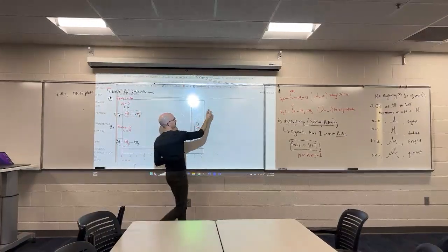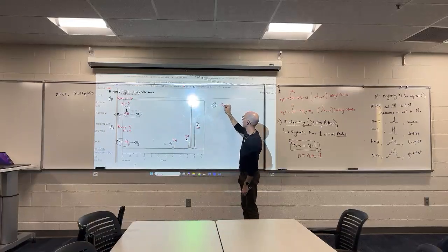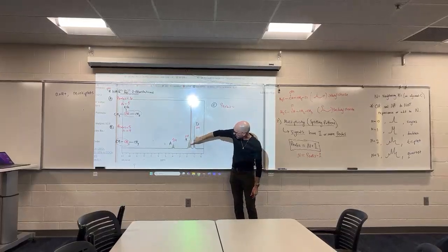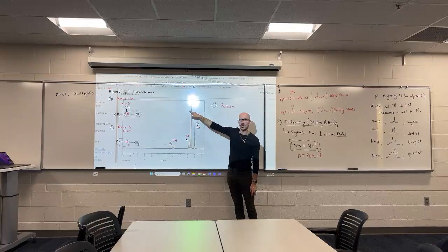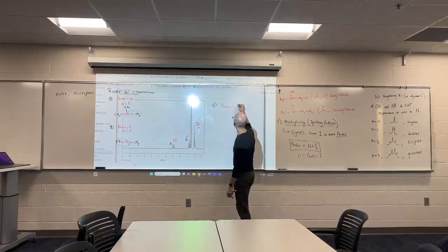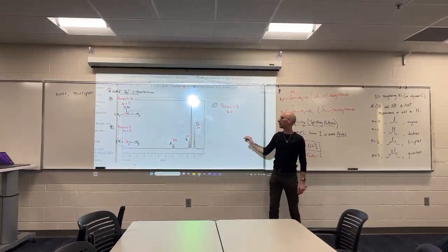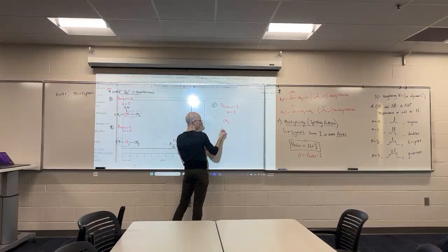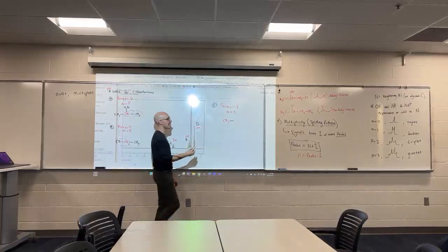Signal C, how many peaks? Well, we accredited this small one to signal B, which means I'm actually just looking at these two giant peaks. 2 peaks. How many neighbors? 1 neighbor. What would that look like? I'm looking at a CH3 group that's bonded to what? A CH.